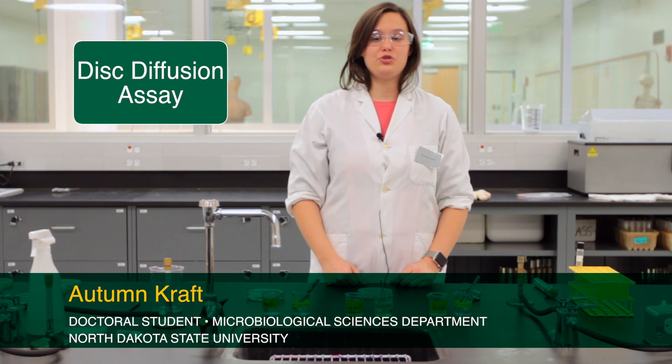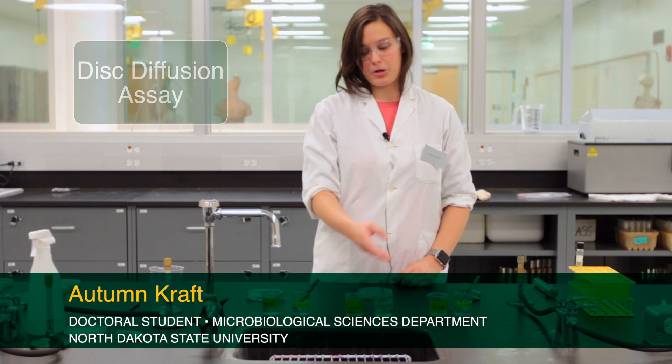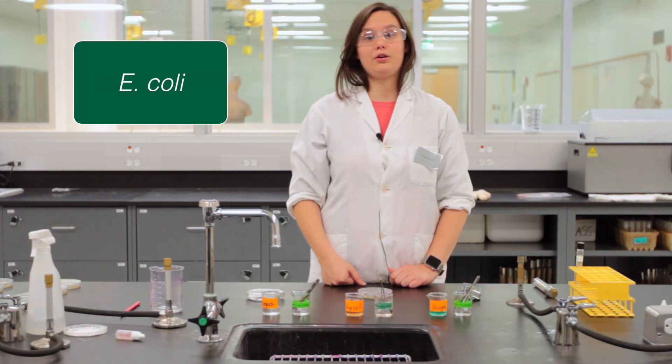Today we're going to be doing the disc diffusion assay, testing different antimicrobials for their ability to inhibit the growth of a particular microorganism. This day we're working with E. coli.